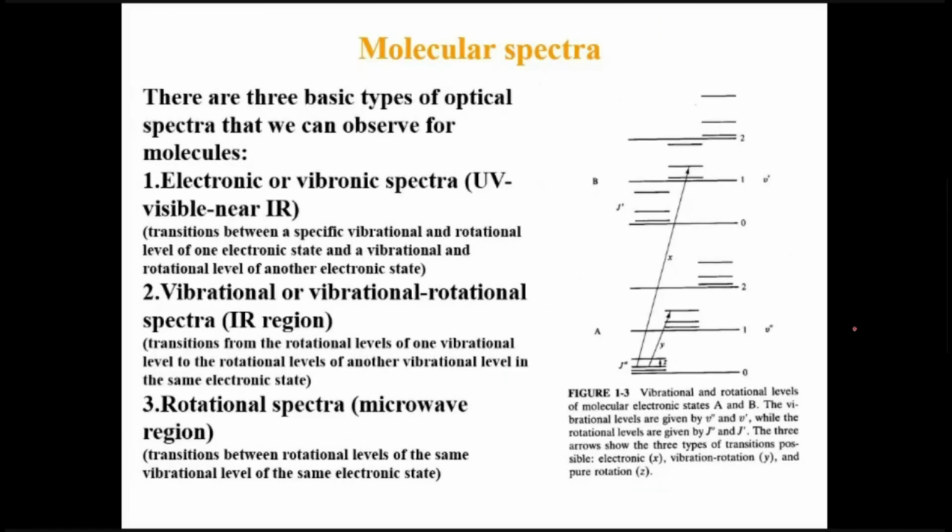So that was the theory behind IR spectra. Now the theory so far explains different levels of vibration. As the vibrations occur, there is a change in dipole moment, and when the dipole associated with the molecule is vibrating, it may absorb electromagnetic radiation of corresponding energy. Okay, this much we have understood. So let us try to relate what we have studied so far with the molecular spectra that we observe.